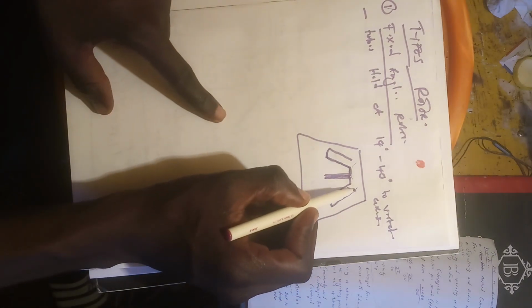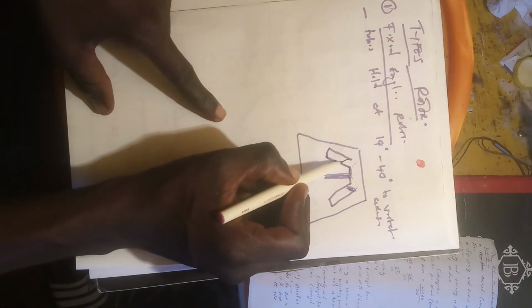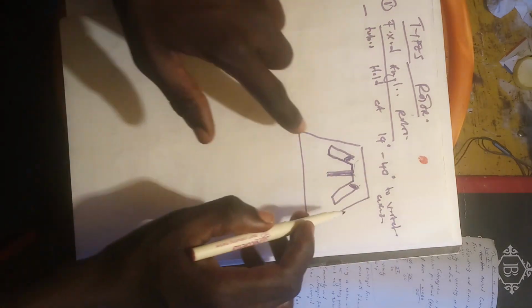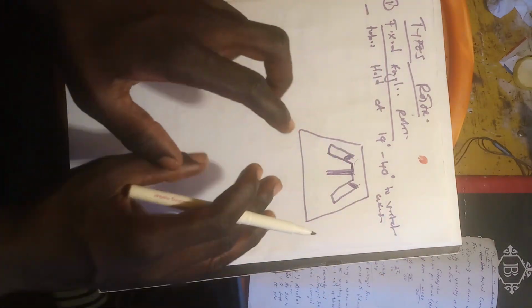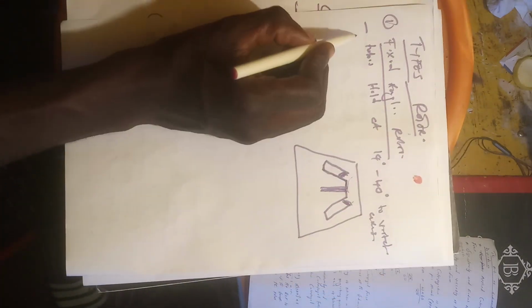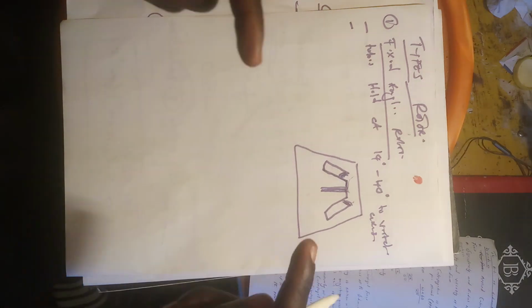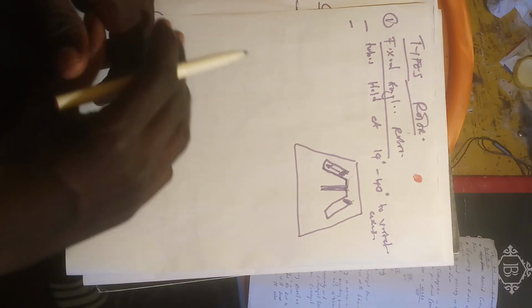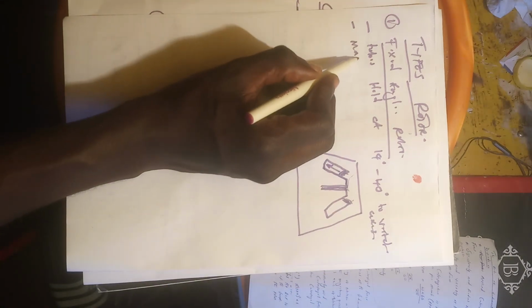So you have particles being suspended in such a way. So these are fixed angle rotors that hold tubes in this type of way. In these types of rotors, what you should know is that separation takes a short period of time because particles tend to move a very short distance with this arrangement.